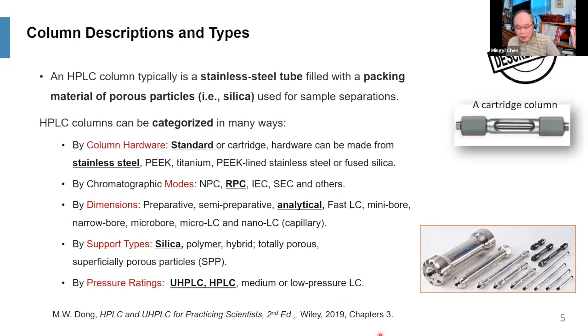Okay, this is quite an important slide. It talks about different types of columns. Some of these are something that you should be aware of, but it's not something that you would actually use.